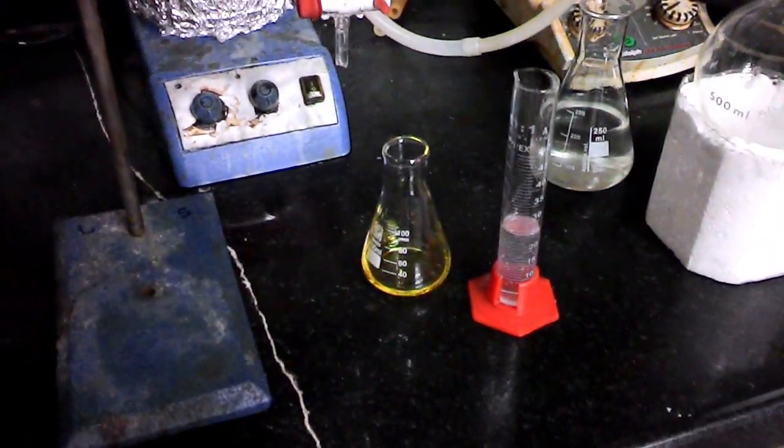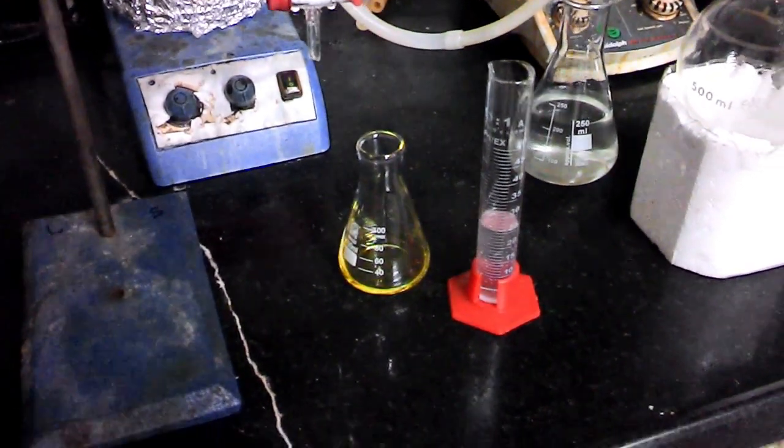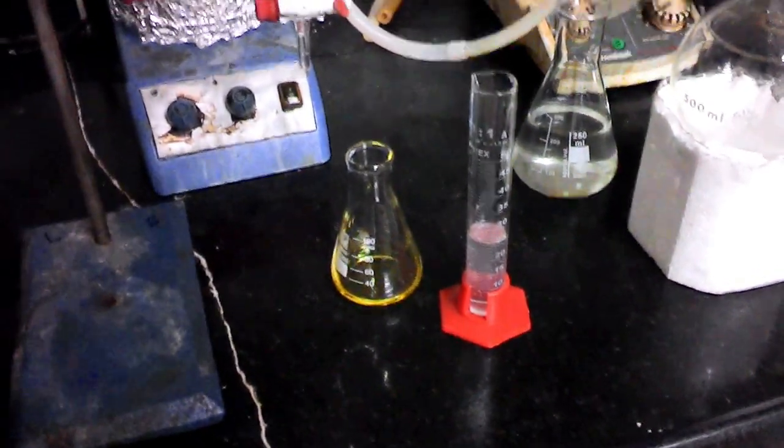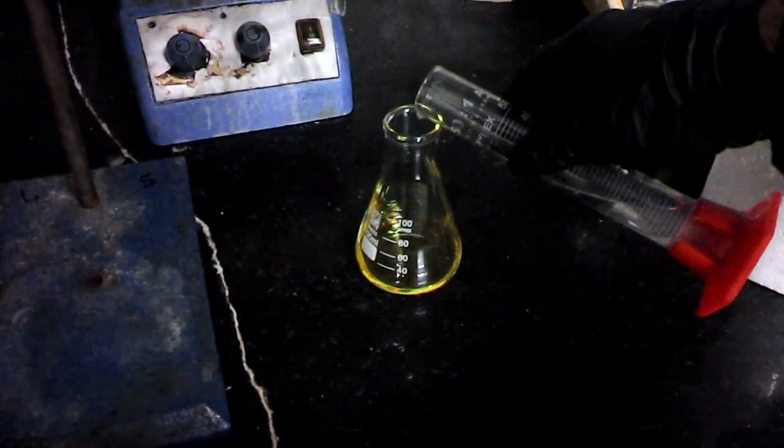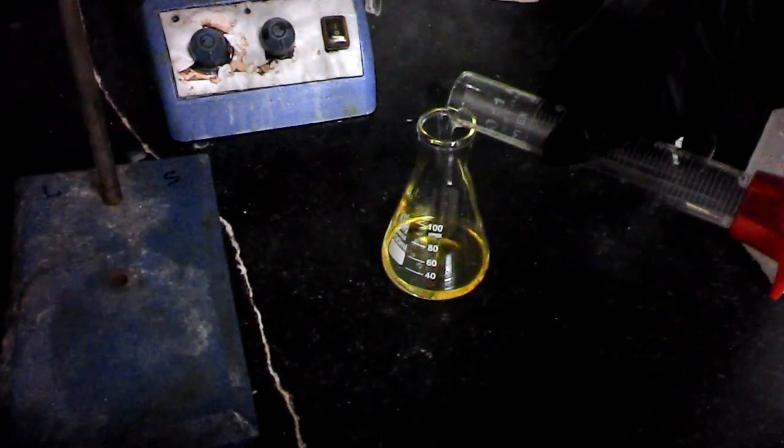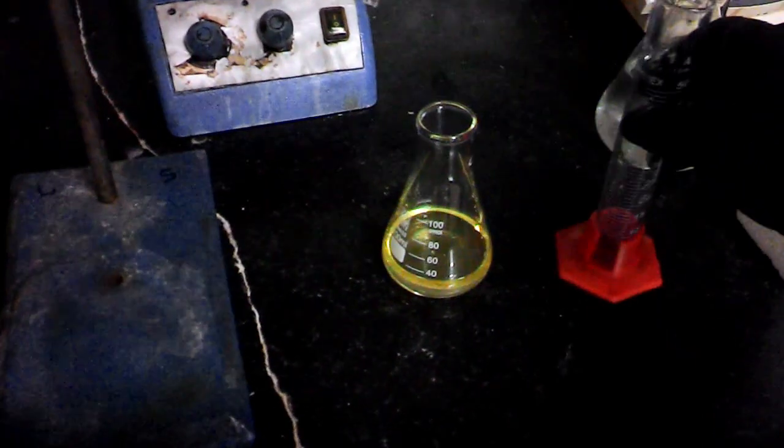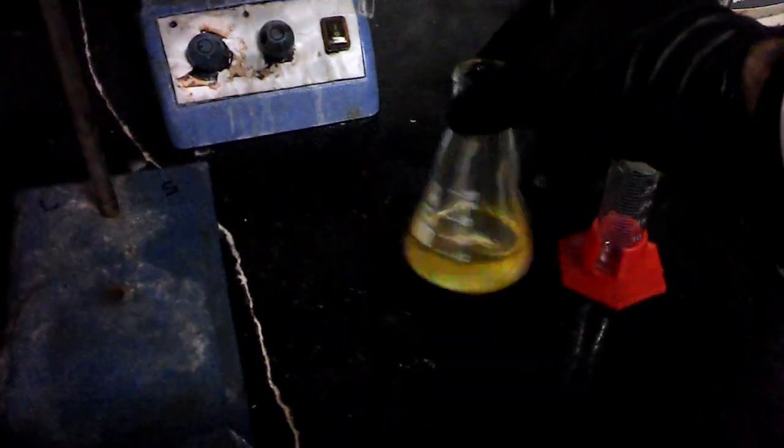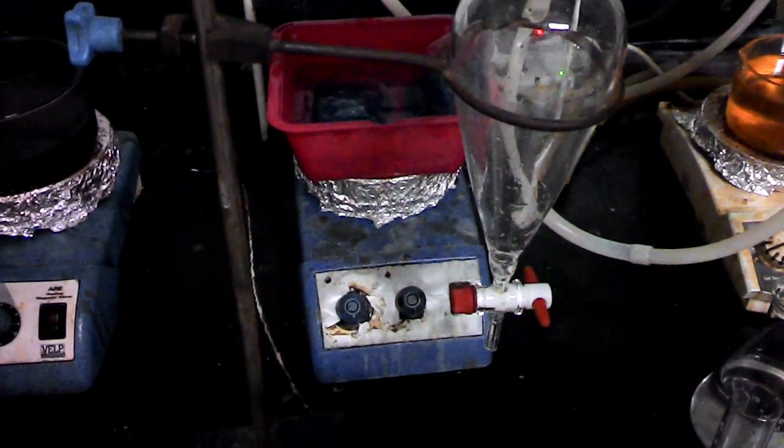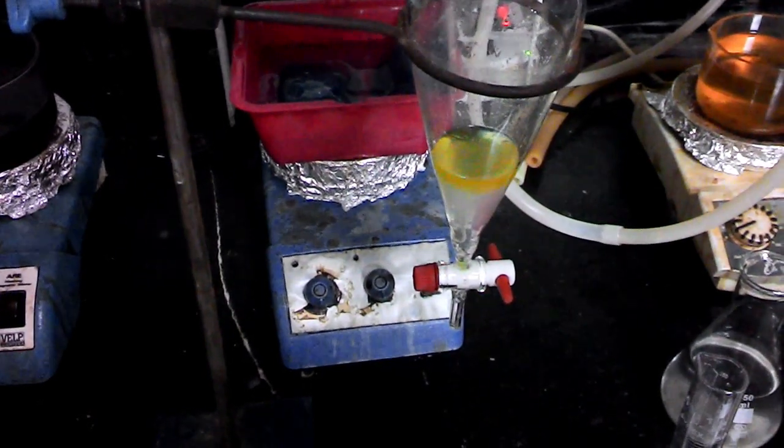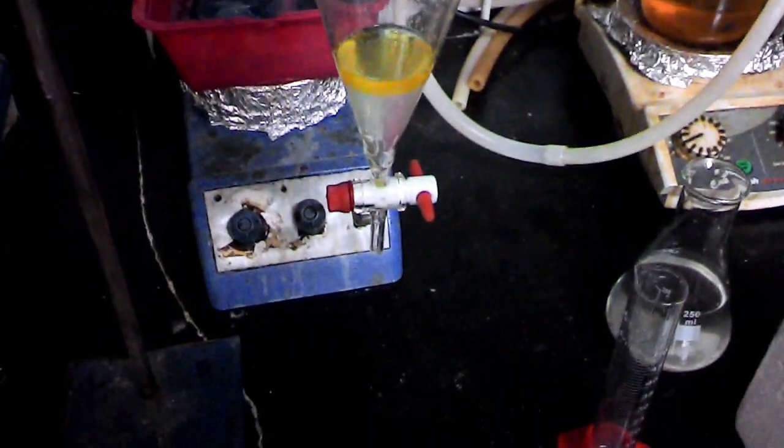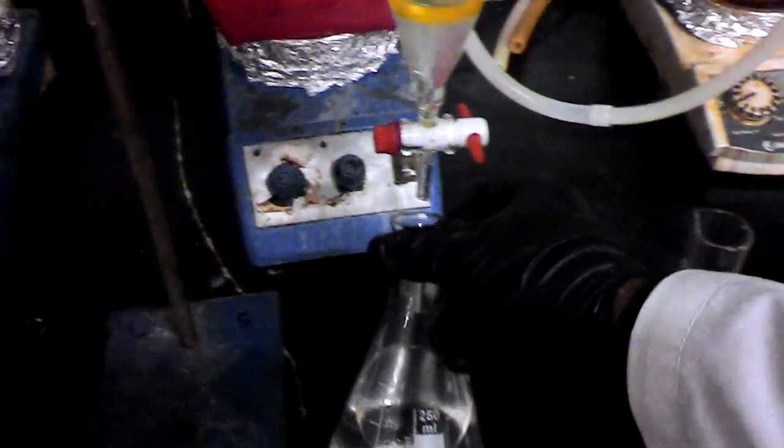Now adding 20 milliliters of sodium bicarbonate solution. We use sodium bicarbonate solution to neutralize the remaining acid. After that, it's time to decant the two phases, adding the discarding phase to the previous waste.